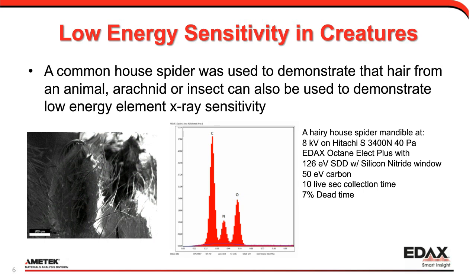Also, having a variable pressure microscope is going to be one of the most important aspects of data collection, and that's because you could work at higher beam energy, you could get that enhanced excitation, but still not damage your sample as much or cause charging or beam damage quite as much. So the variable pressure capability really lends itself well to life sciences applications.